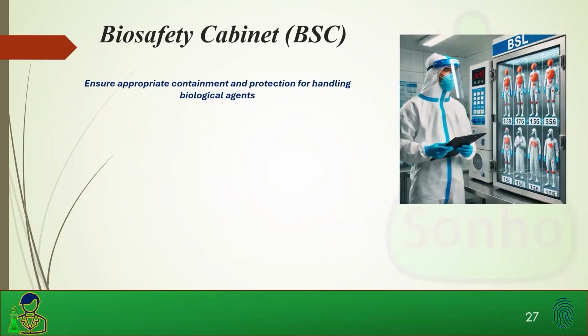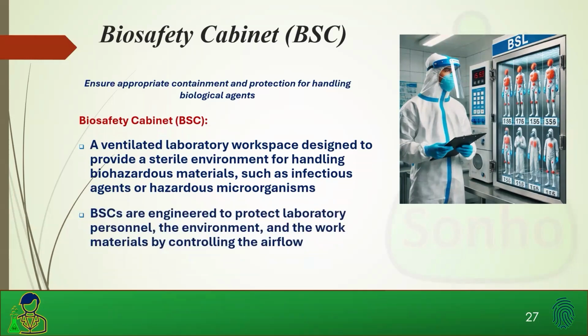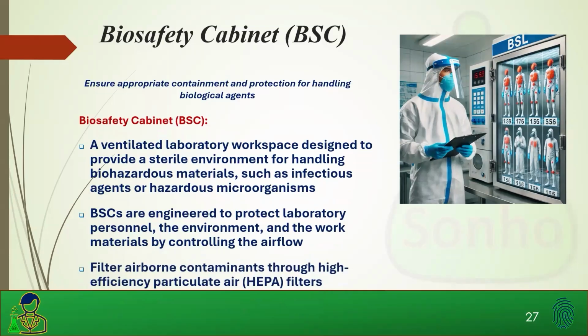I spoke on a biosafety cabinet. And the biosafety cabinet is a ventilated laboratory workspace designed to provide a sterile environment for handling biohazardous materials such as infectious agents or hazardous microorganisms. Biosafety cabinets are engineered to protect laboratory personnel, the environment, and the work materials by controlling airflow. They filter airborne contaminants through HEPA filters.